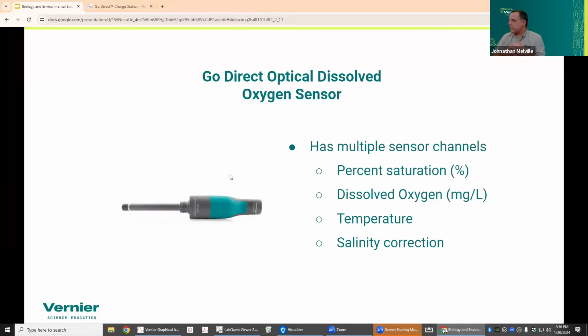The stations are in recall. Some of them are. We're getting that fixed. They're still great things. They're going to be great to use. Another thing that you can do though is you can also buy a powered hub. That's another option to charge your sensors as well.